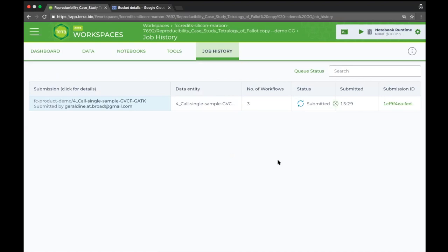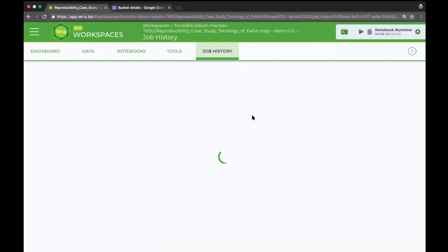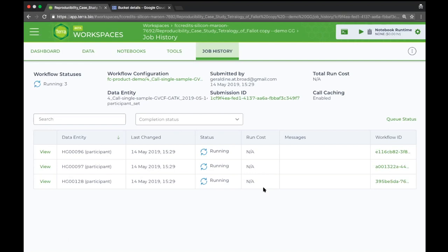Sometimes it takes a few minutes to get going, but once it gets going it's just running on the cloud and you just need to wait for the results to arrive. Let me show you something else, and hopefully by the time we get back, because these are exomes, some of it might already have finished.